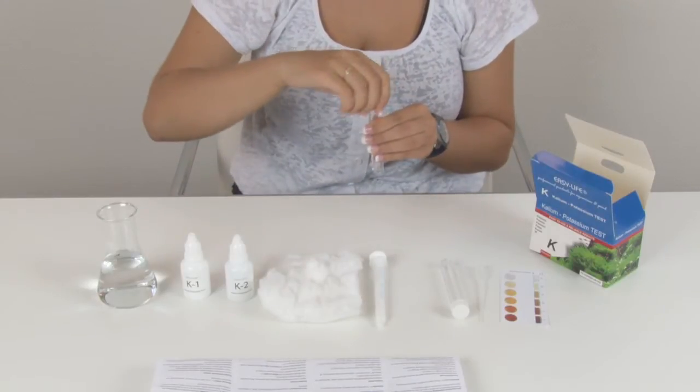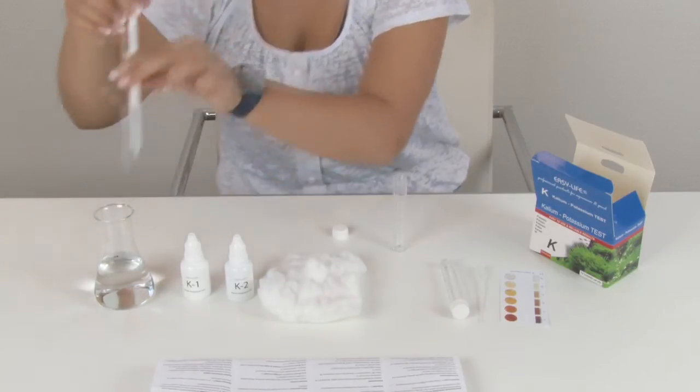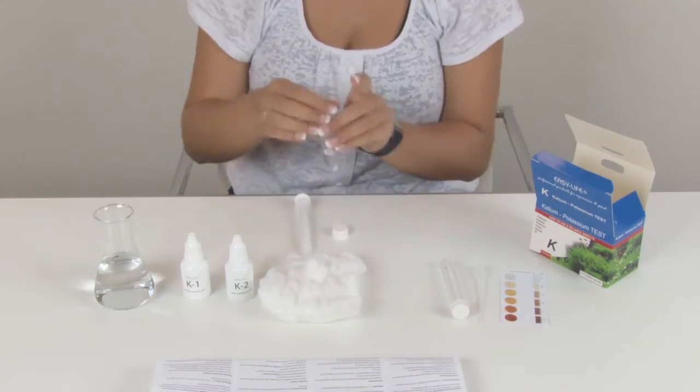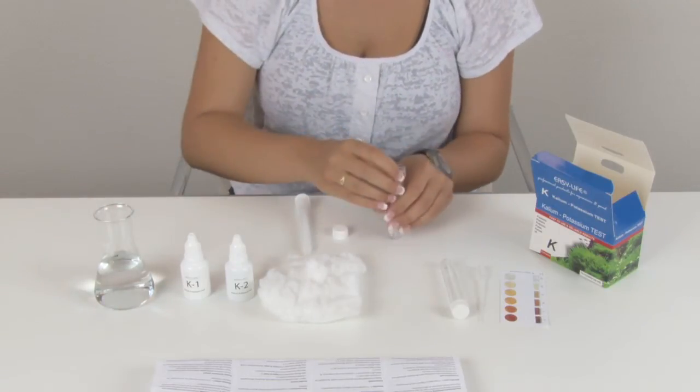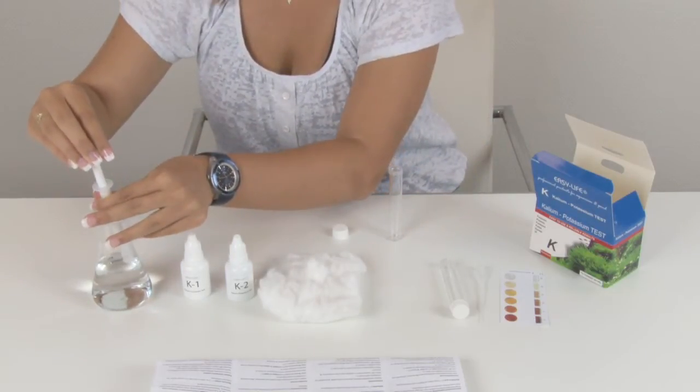Rinse the test tube with some sample water, and fill it with 2 ml sample water.